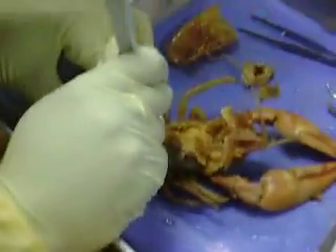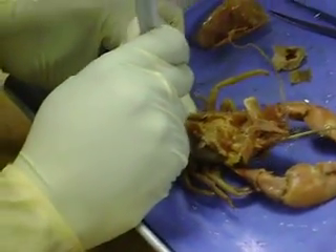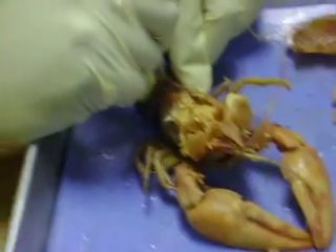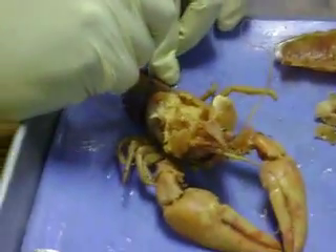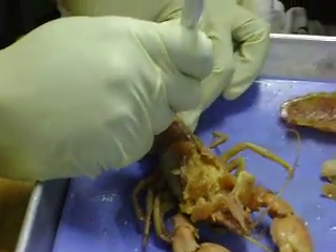I'm making a dissection — this is the beginning of my dissection channel on YouTube. It's okay for me to say that.